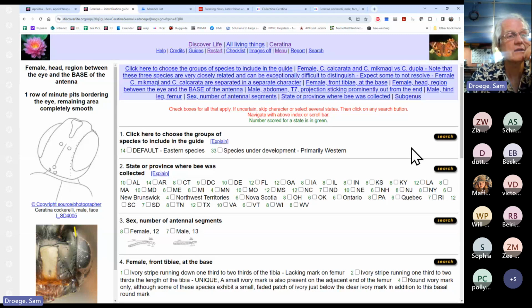What you're looking for essentially is a difference between specimens where the scutum is highly pitted, with pits encompassing most of the scutum, and then we'll talk about what most means, and specimens where big chunks of the scutum don't have pits.